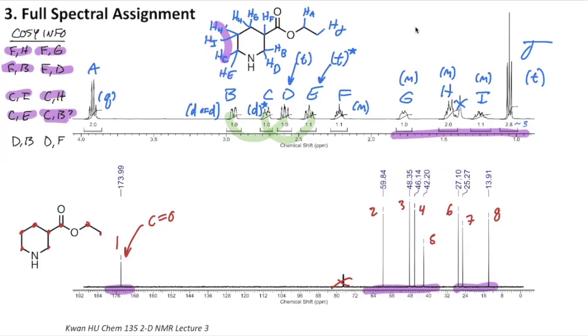That seems good. Since we've got the data for D here, let's check D as well. D correlates to B, there's our geminal coupling, and D correlates to F. Perfect. So it looks like proton F, B and D, and C are all in the right place. I think E is probably pretty good too, but that's maybe one we should look at next just to make sure that everything else makes sense. So I think that's a really good start. What I'll do next is just tabulate all of our other COSY peaks so that we can go through in the same way and look for these correlations.